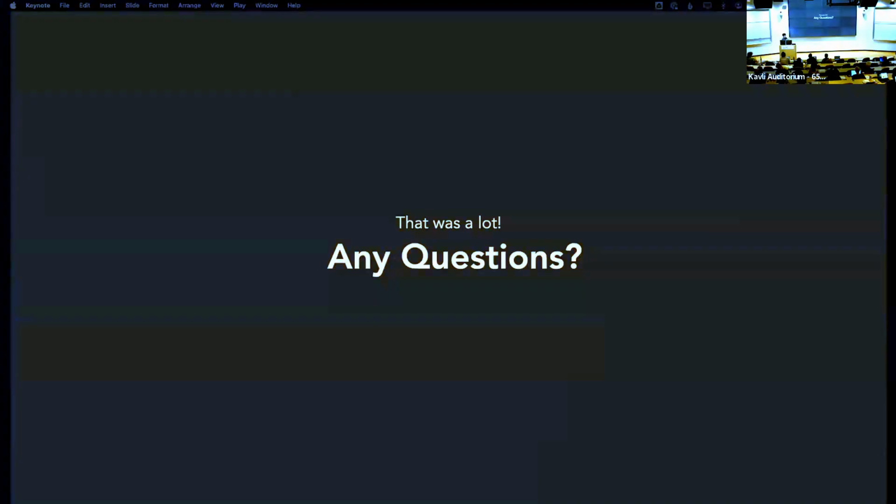And this step was particularly tricky. So I figured right now we can take some questions. And if you guys can understand this, then you have a very good understanding of symmetry expansion, because we basically just did it manually. Okay, so any questions from this slide or the rest of the case study up until this point, I'd be happy to take.